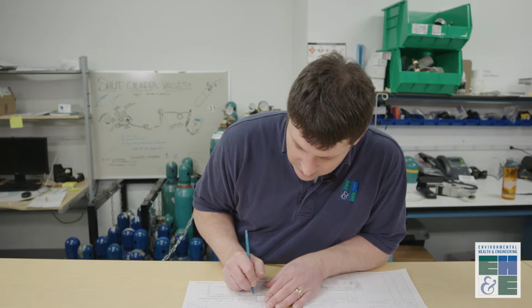Most important thing about the chain of custody is that it documents that the samples were in our custody from the time that they were collected until the time they arrived at the laboratory. So it's important that we sign relinquish. If, for example, we're transferring samples within EH&E between, for example, the FOSC and then the lab, we can transmit custody from the person that collected them in the field to the FOSC. And in every case that the samples are transmitted, there should be a signature indicating the transfer of the samples. So I'm going to also indicate the date that I am relinquishing the samples.